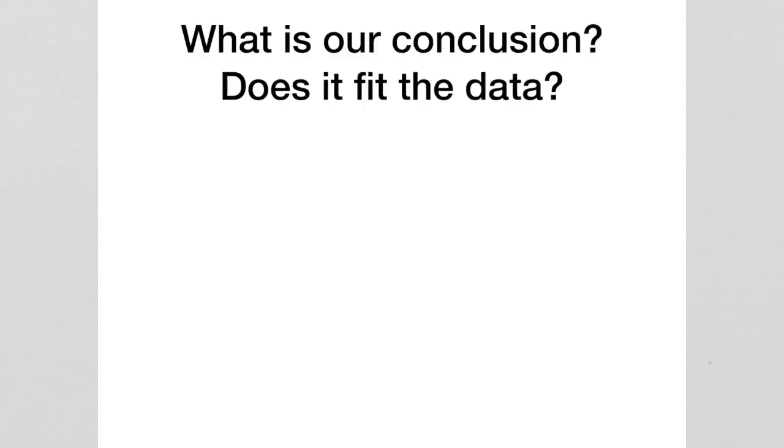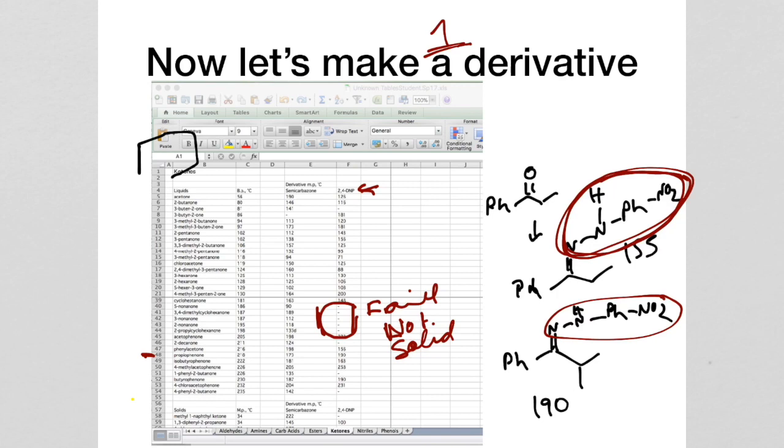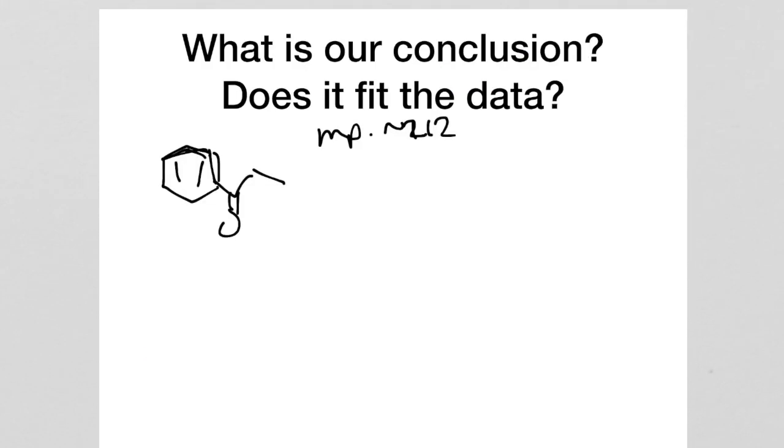Okay, so what's our conclusion and does it fit the data? Well, our conclusion is that our unknown is propiophenone. Does it fit the data? Well, we had a boiling point of, I believe, around 212 degrees. The literature value of the boiling point of propiophenone is 218. Excuse me, I said melting point, but that was a boiling point. It's 218. So it's reasonably good agreement.